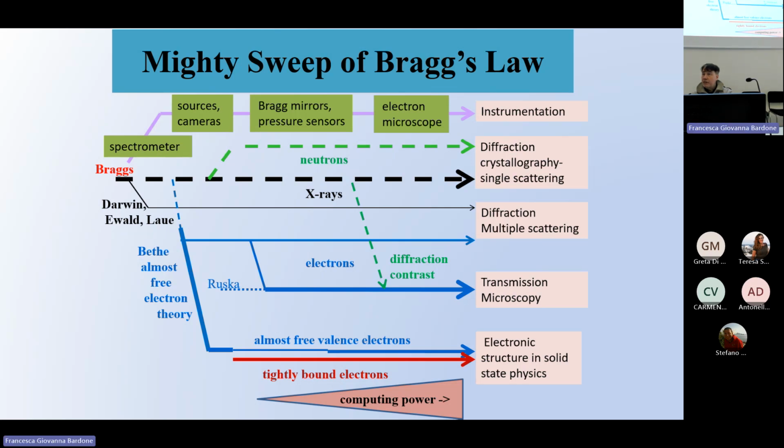With X-rays, you can reconstruct 3D. Yeah, well, you mean the difference? Why use it, so that you really get a three-dimensional image? Well, I think with electron microscopy, you can detect three-dimensional information, but basically only of the surface. I wish you could have information also from inside.